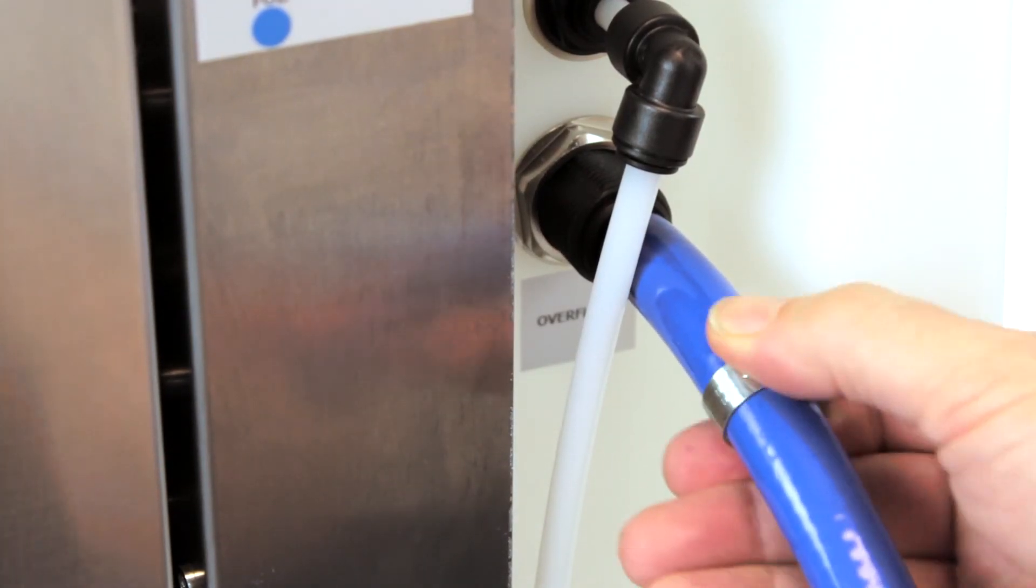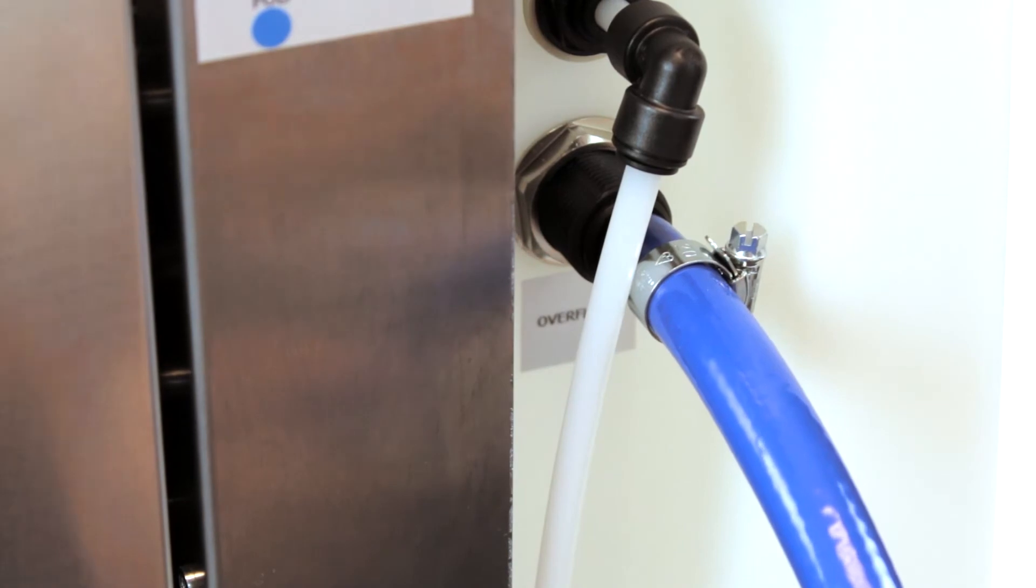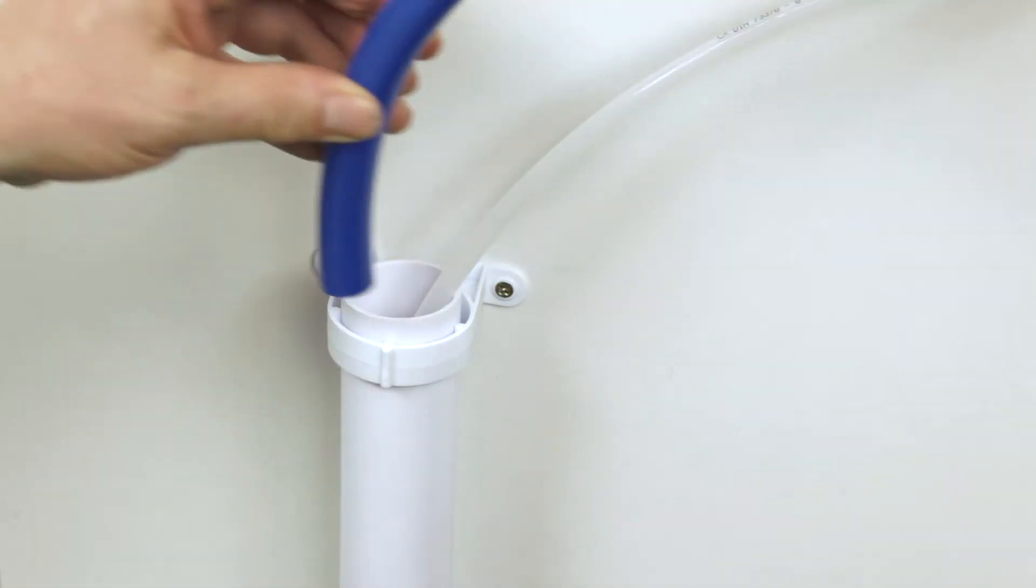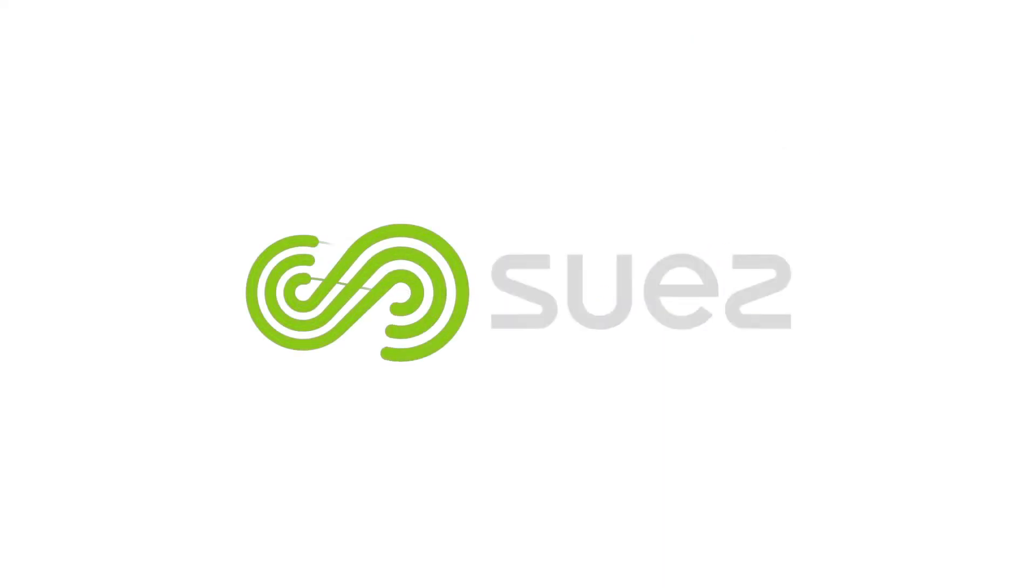Fit the 12mm blue hose to the tank overflow, secure using the hose clamp and run to your drain outlet.